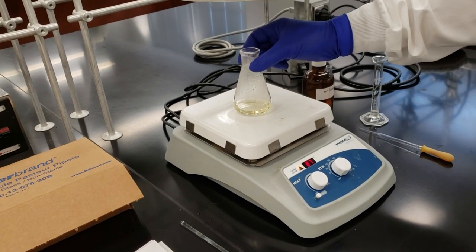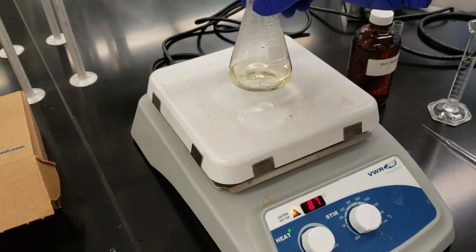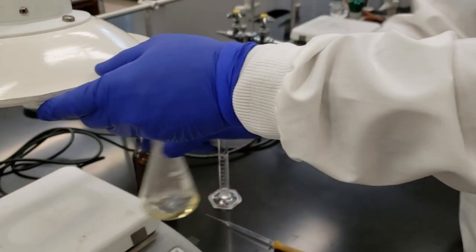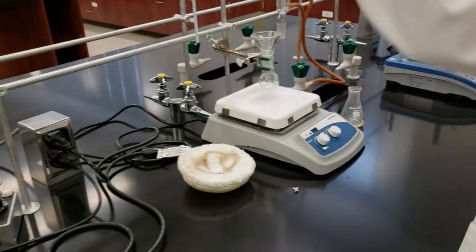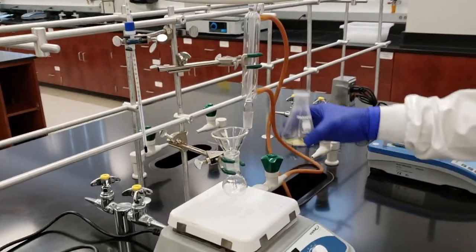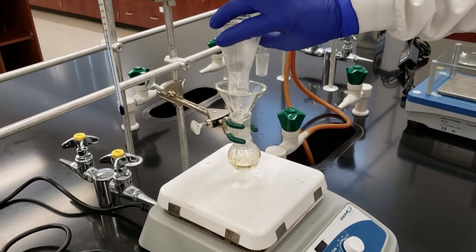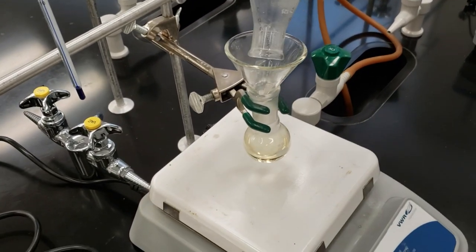So our solution is fully dissolved. Our ammonium bromide and chloride are dissolved into our acid and water solution. We're going to take this over and add it to our round bottom flask. I'm going to bring our snorkel over just to be safe. We're going to catch our boiling chips in our funnel. We don't want those to go in.